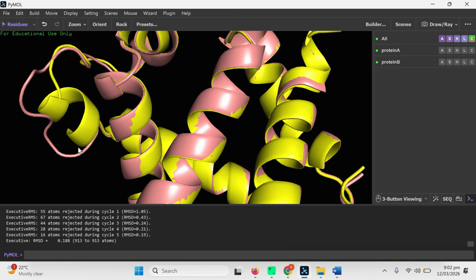You can point mutate different protein positions and see at which mutation the protein is the most stable. So this is the benefit. Using AlphaFold, researchers can quickly evaluate possible structural effects of mutation before performing the experiment. It saves a lot of time.